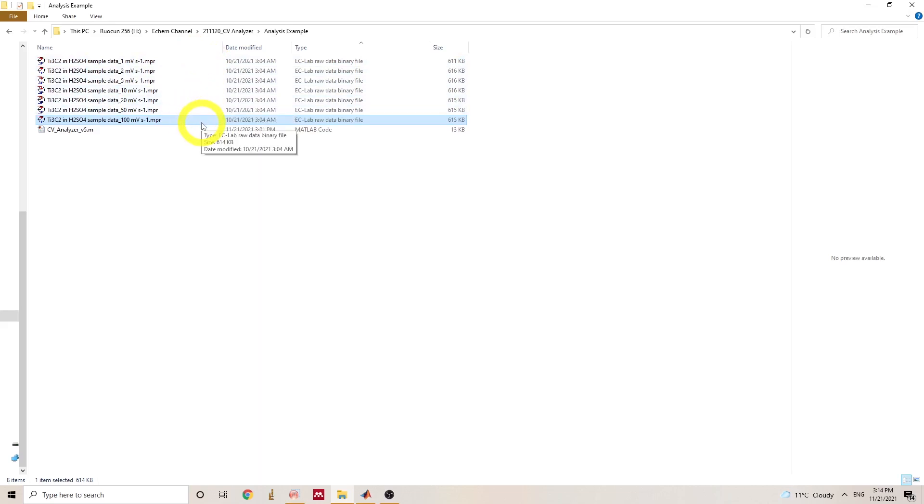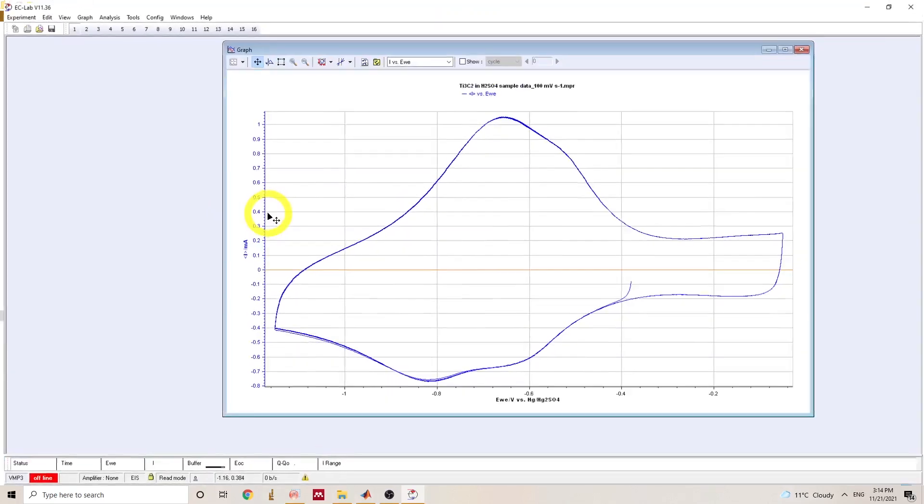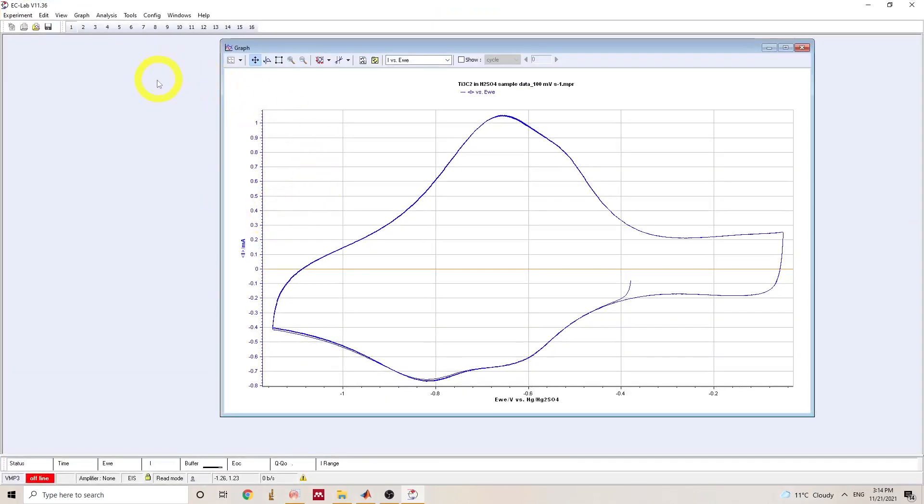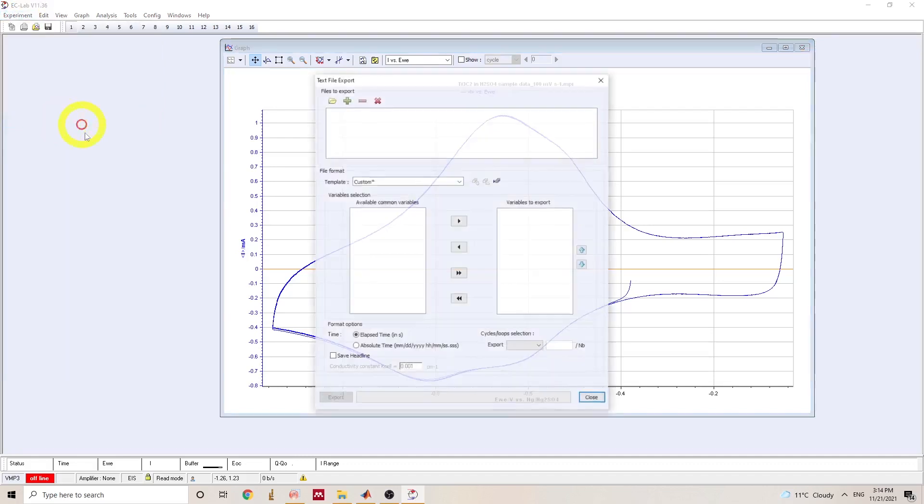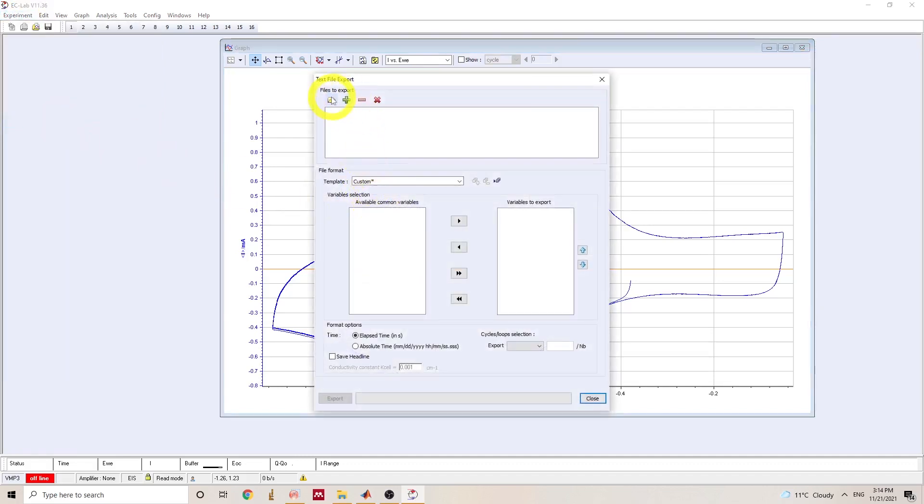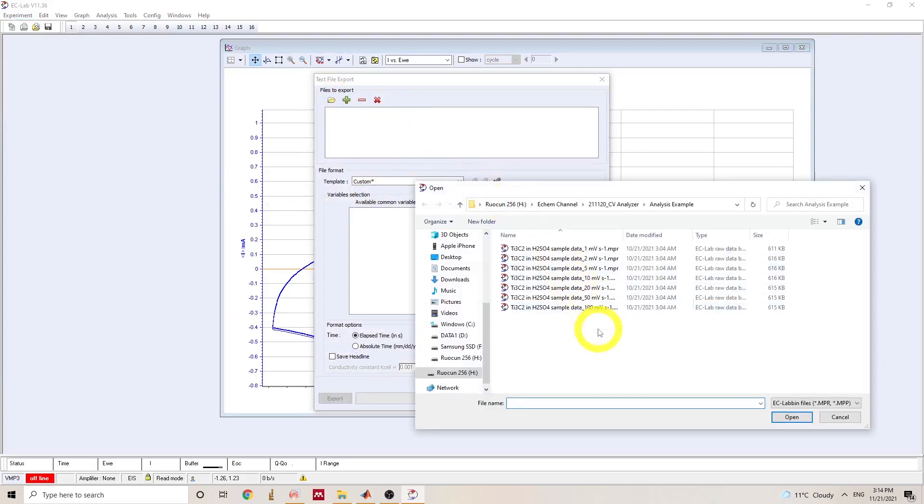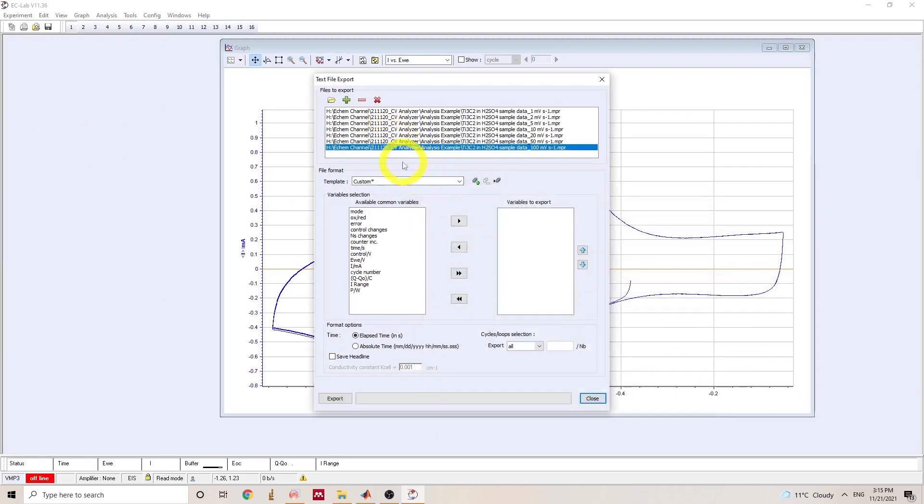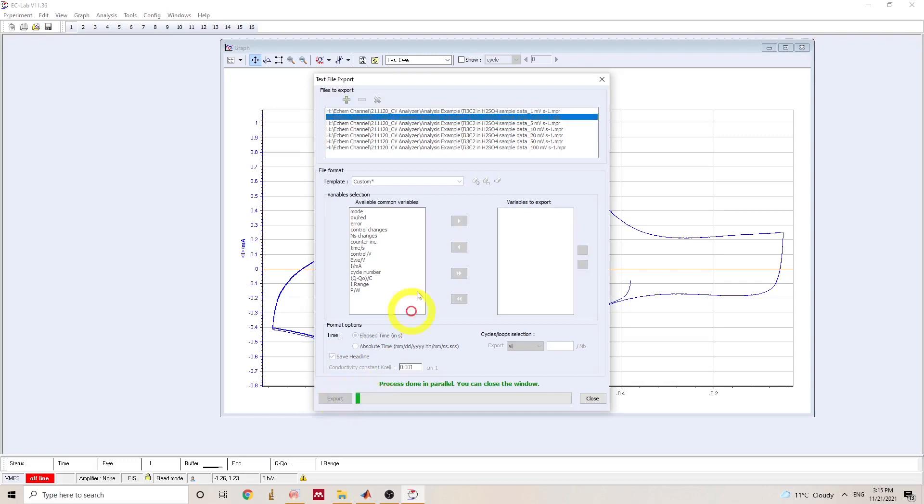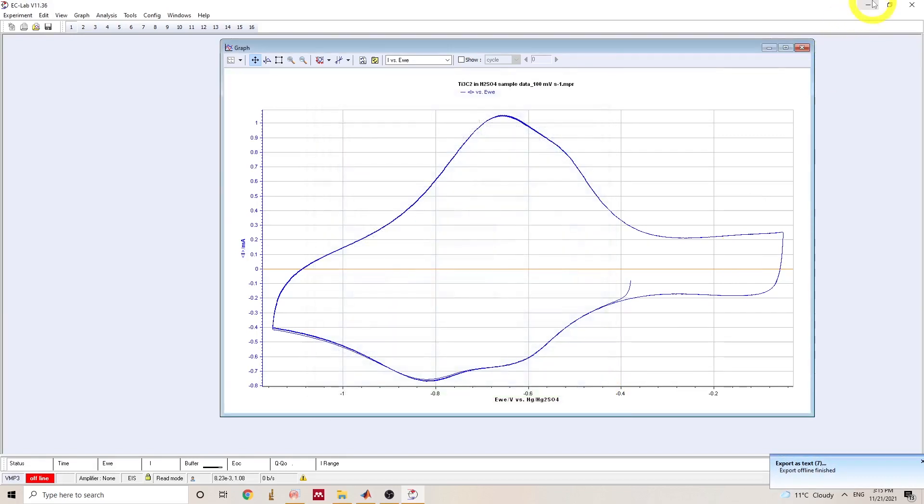To use the code, first we need to open this NPR file that's generated by ECLAB software. It's a software associated with the biologic potentiostat. So we can export file from here and we need to load these files into the interface and make sure to save headline. It's required for this analysis code. So we can hit export to export all these files.